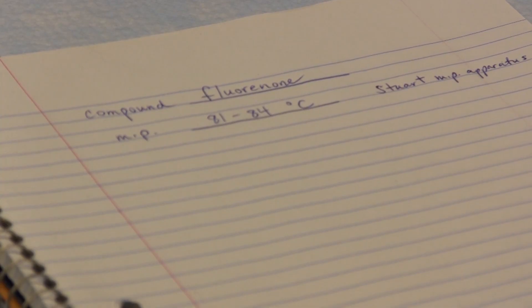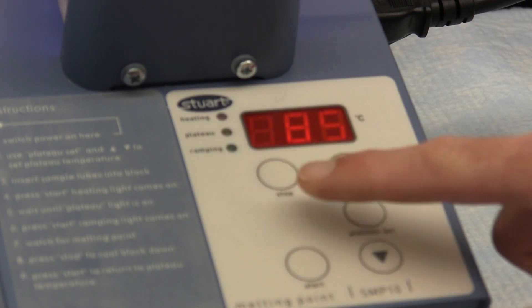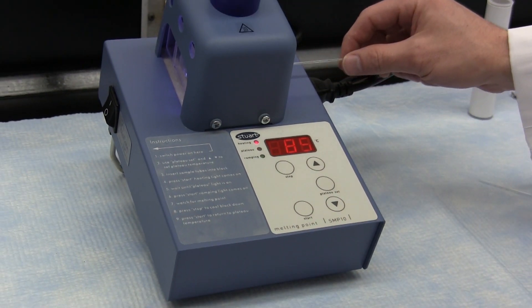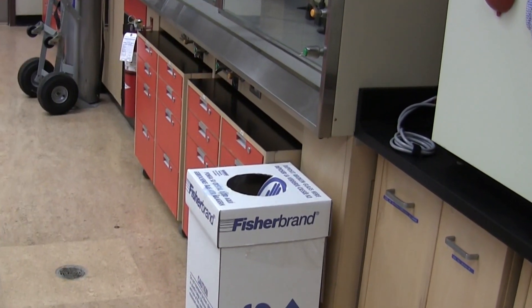After the melting range is recorded, press the stop button. All the lights will go out and the unit will cool down to ambient temperature. If you need to repeat the determination, pressing the start button again will cause the unit to return to the plateau temperature instead of ambient — note that the heating light will come on even if the temperature is above the plateau and the unit is in fact cooling. Otherwise, the capillary tube can be removed and discarded in the glass disposal container.